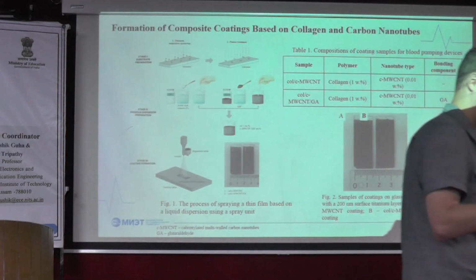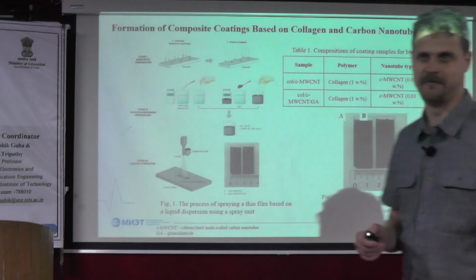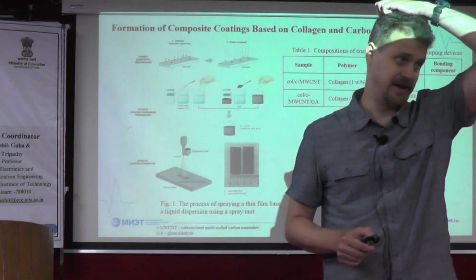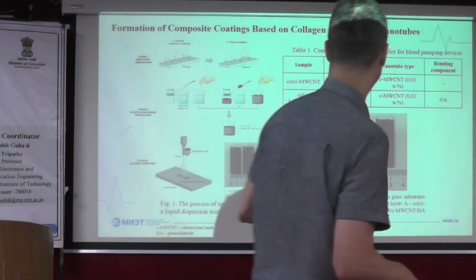This is the type of microfluid device that I will just allow everyone to look at closely. So don't worry about this film. The only request I have, please do not break the microfluid system itself. The film is just experimental, so if you break it, it's just a glass substrate with the experimental film for this particular device.